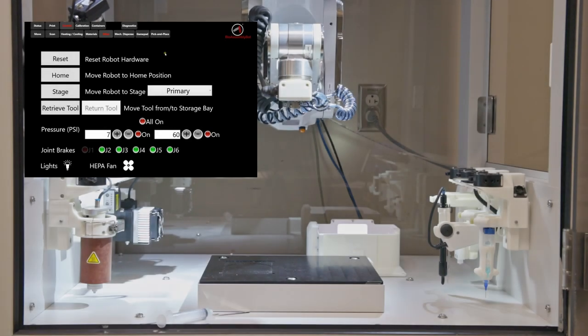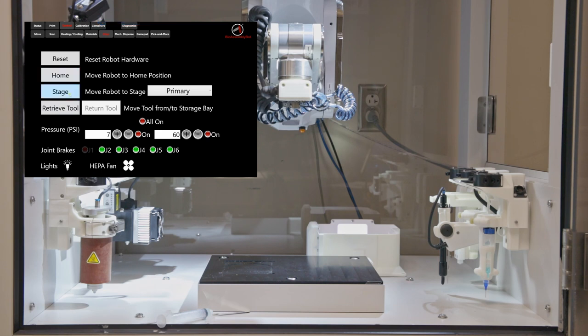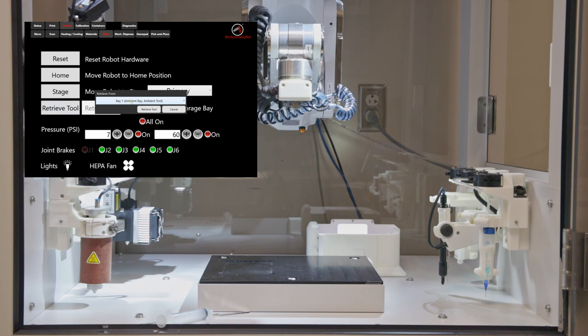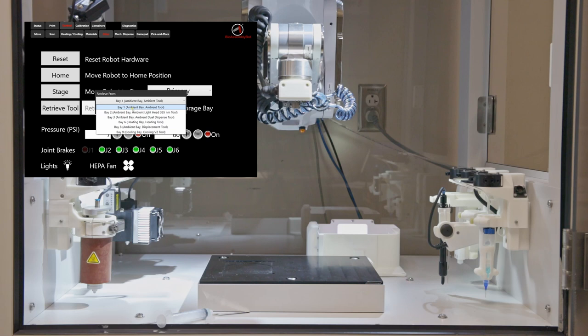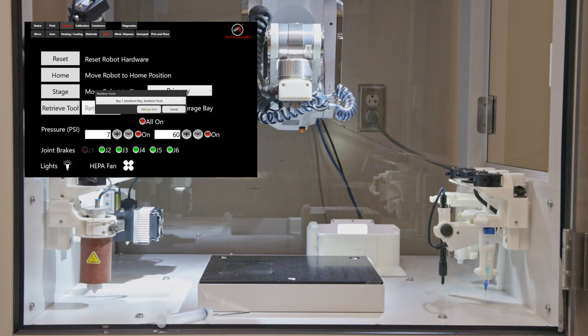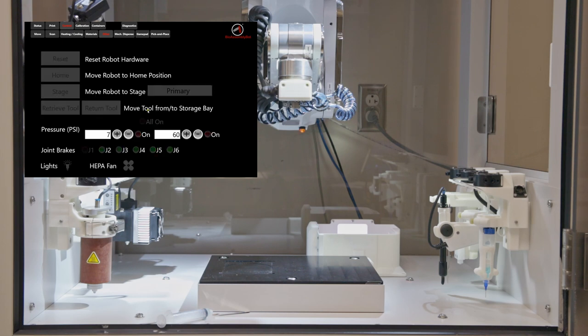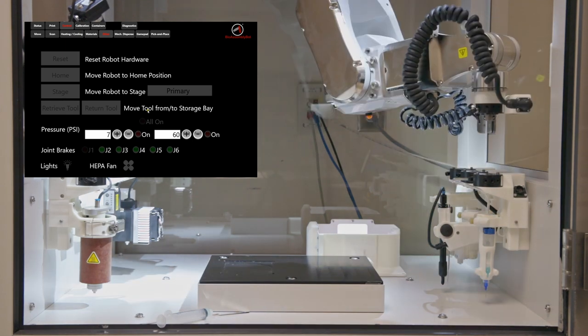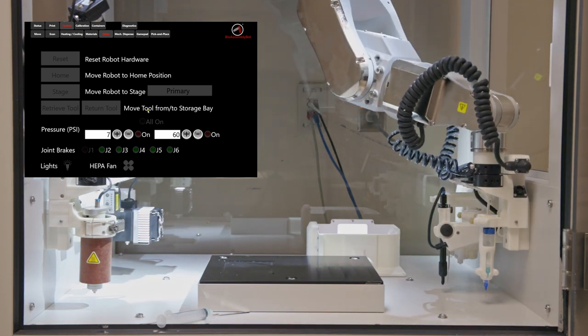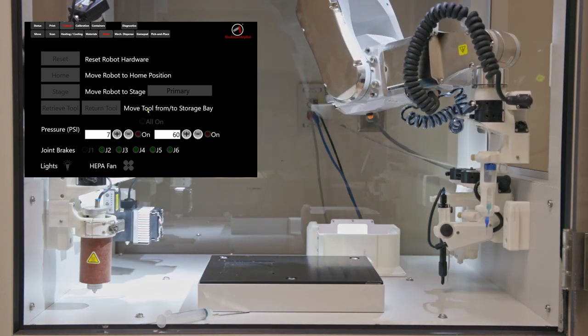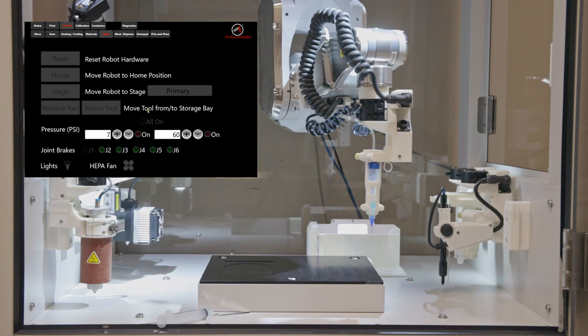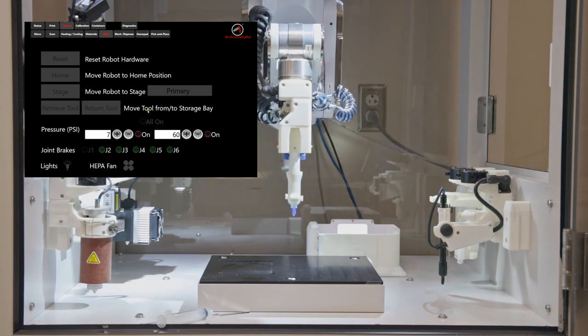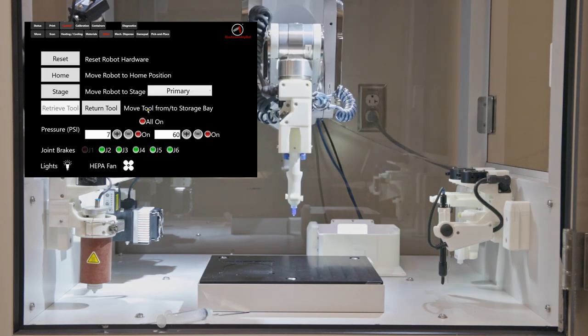To optimize the extrusion pressure, click on control menu and click on other. Now click on retrieve tool. From the dropdown menu, choose the printhead that we want to work with. Now the printhead is picked up and is positioned over the stage.